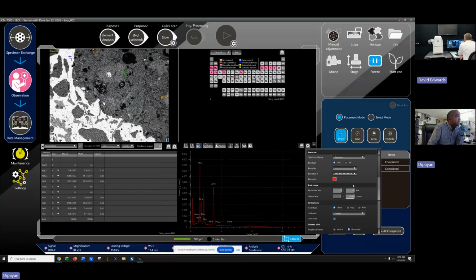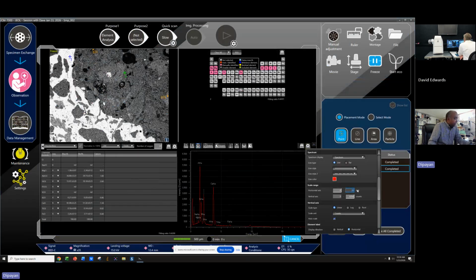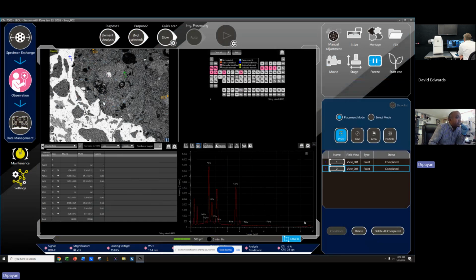Oh, okay. But next time it will be fine. When you do new ones, they'll all be red. But right now, you've already done them. Now you have to change them. It's okay. Next time it will not happen. It will come as 10. No, so now, it'll still come as 20. Now, on the left side of the spectrum window, you've got two icons there. The second icon says custom scale. That one will put it to 10 for you. Oh, okay. So I have to click that to make it 10. It'll always start as 20, and you click that to go to 10.